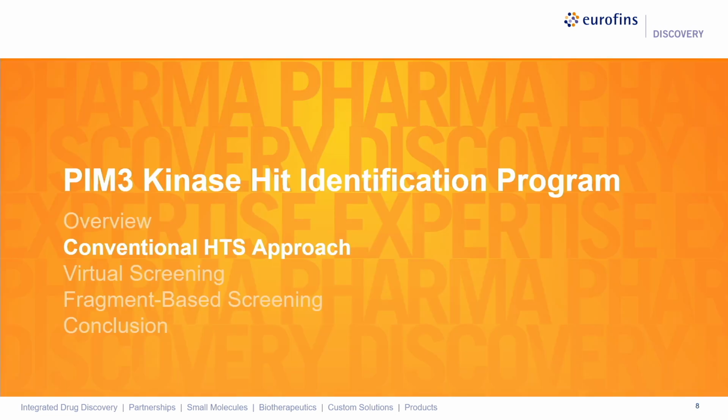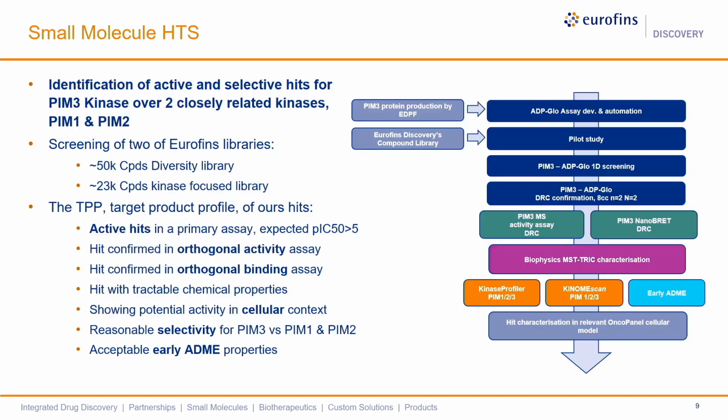So I will start by presenting the data of the HTS approach. For this first part of the program, we combined several assays, and we screened a part of our library, in total 73,000 compounds, combining a diversity set and a hinge binder kinase-focused subset.